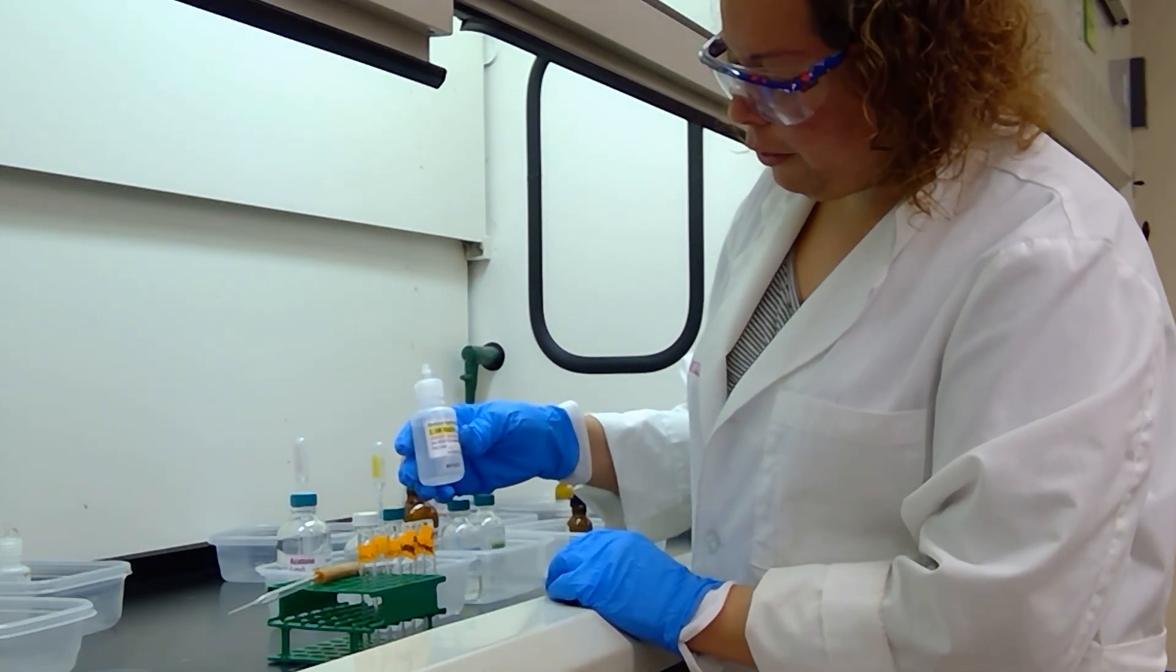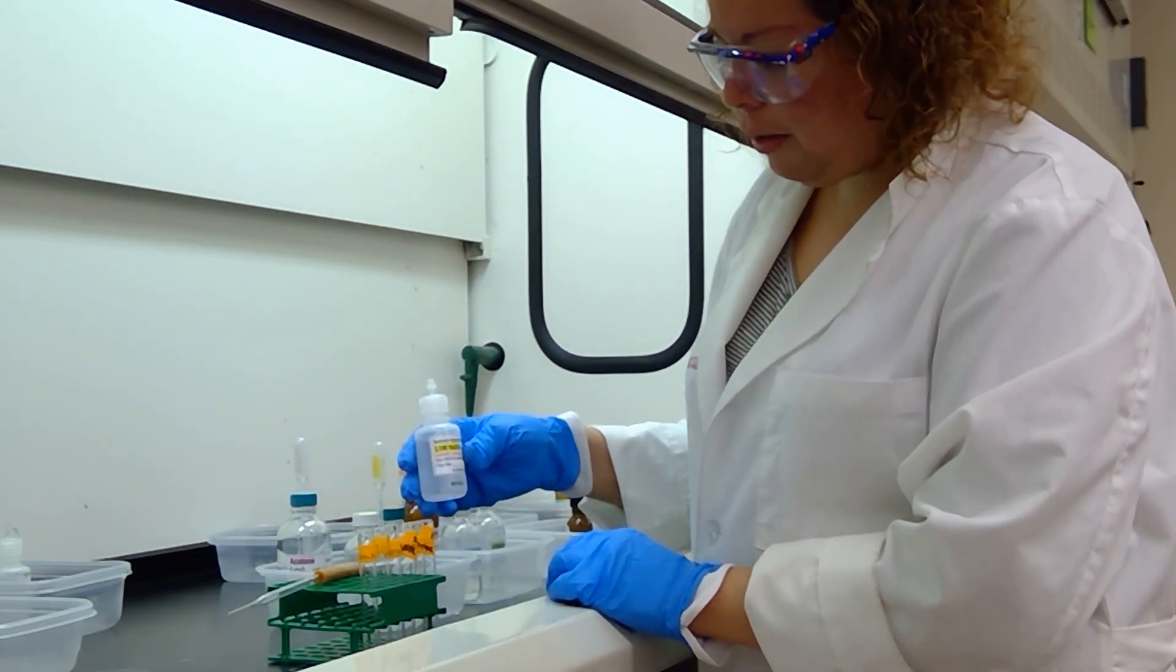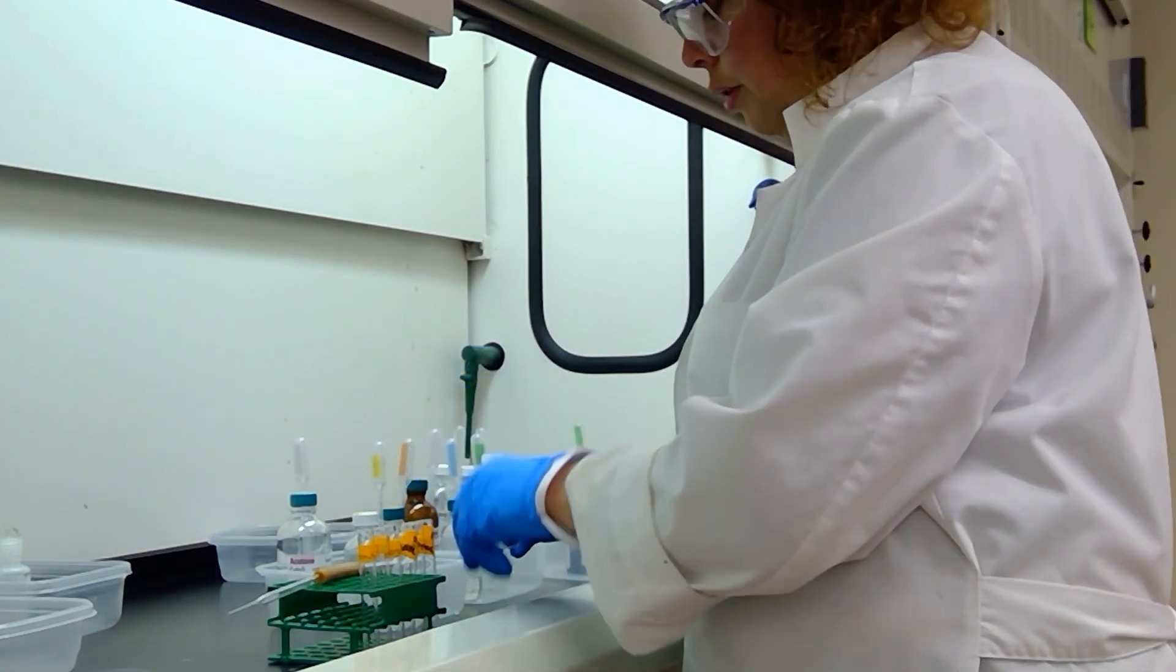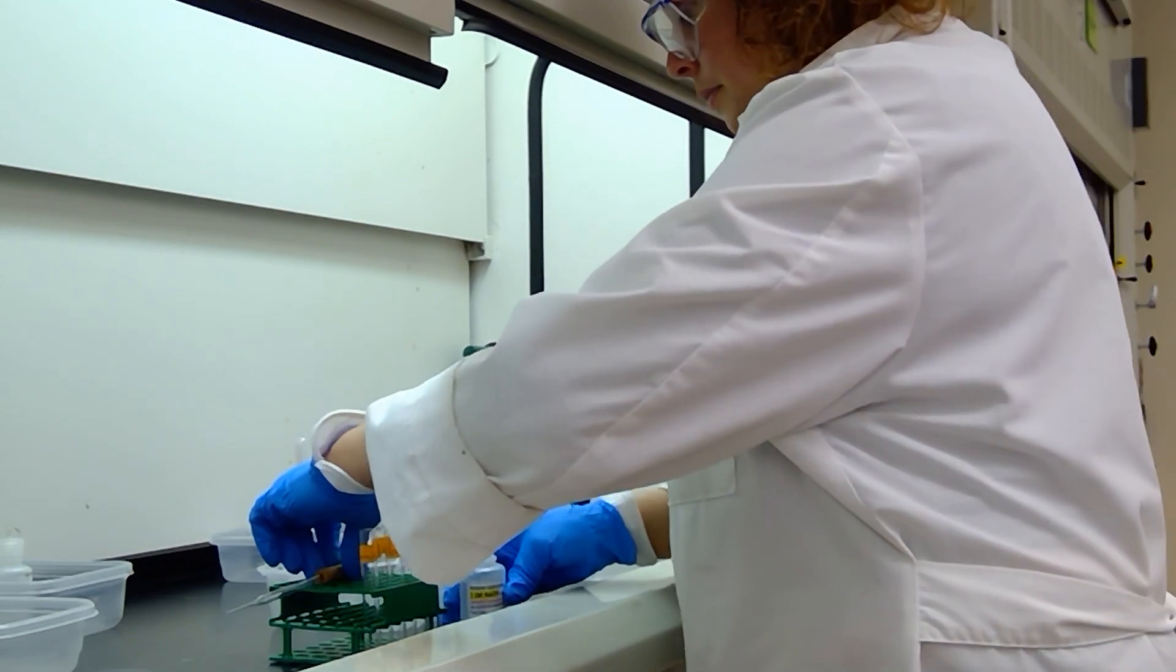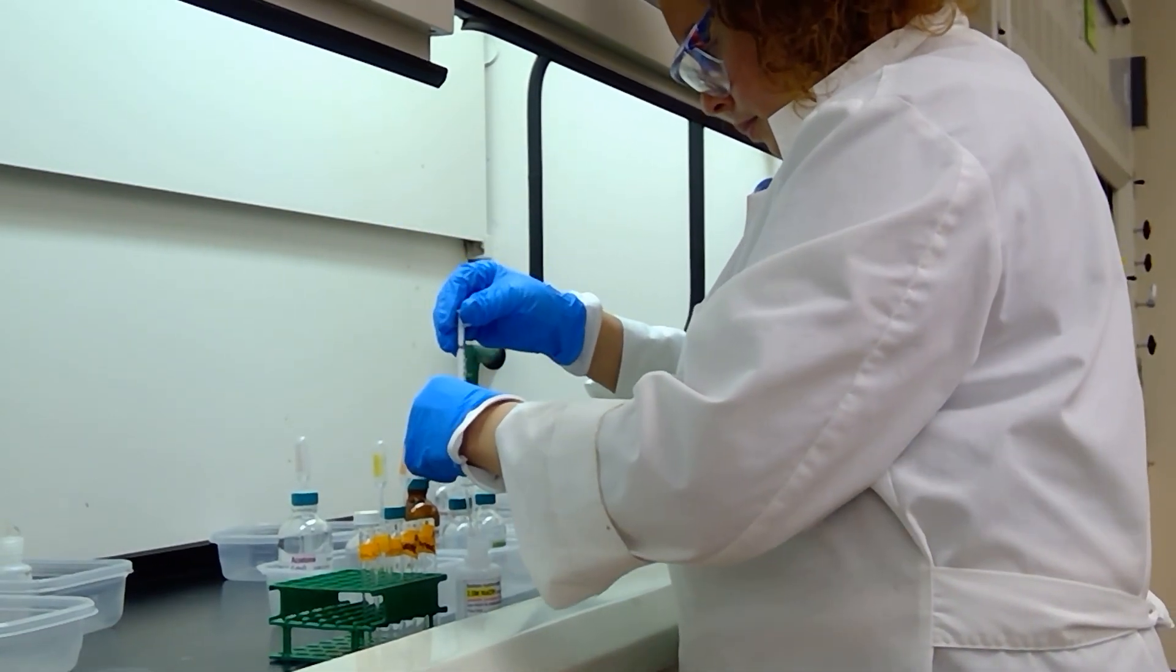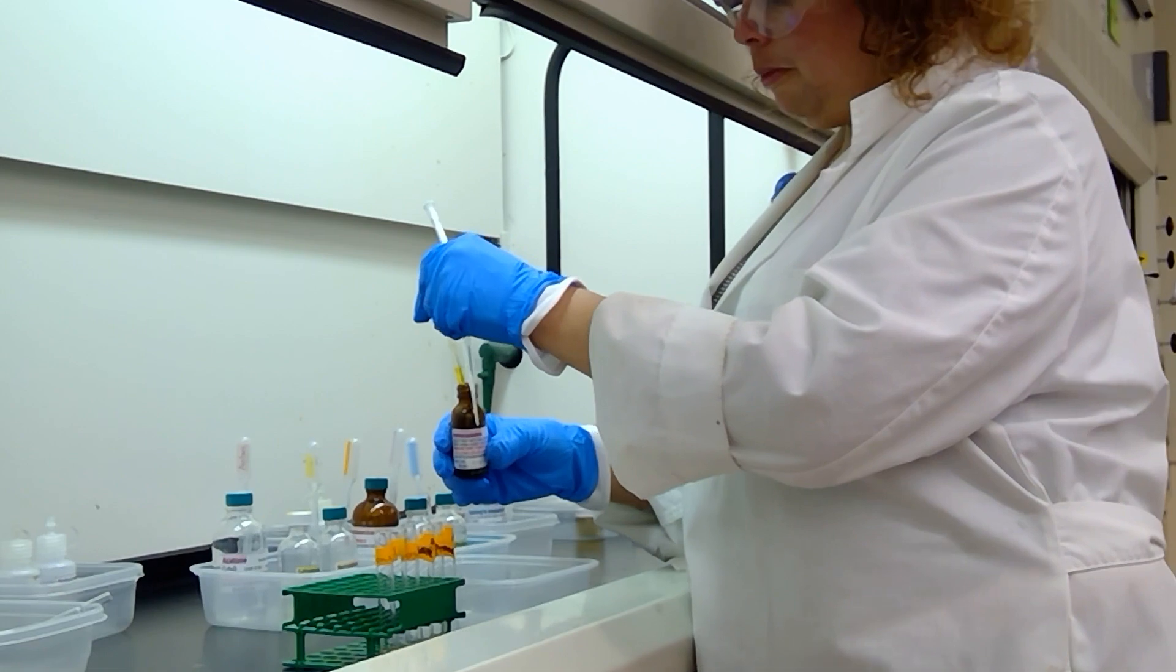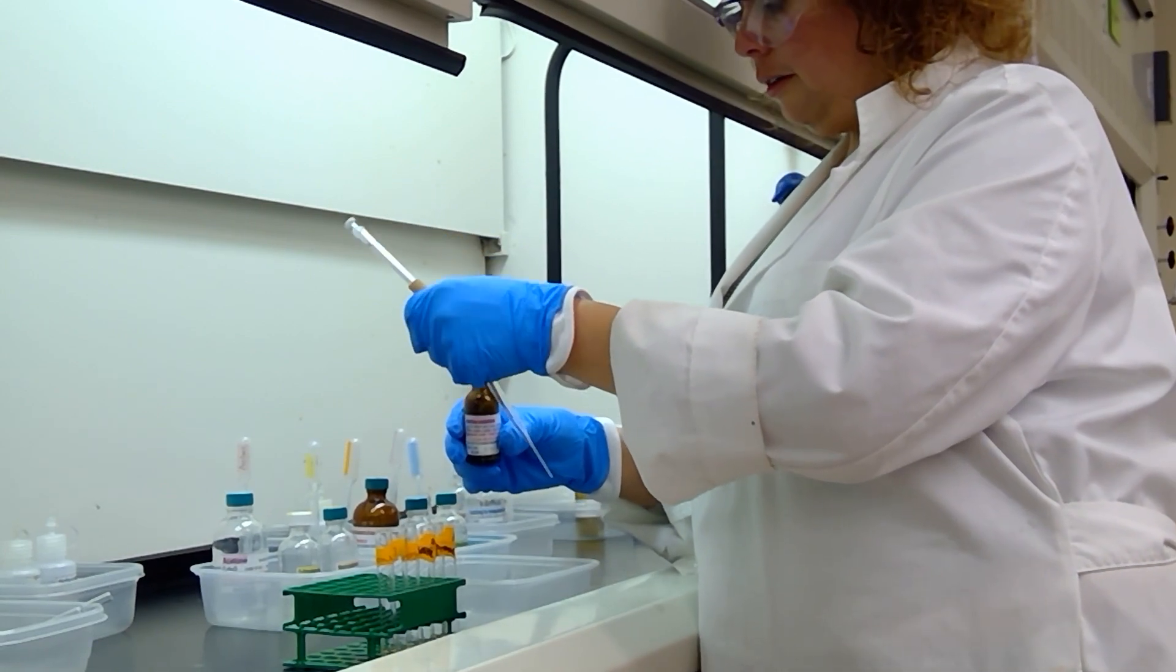Next up we are going to add 2.5 molar sodium hydroxide, this is the same as 10% sodium hydroxide, and for each of these samples we are going to add half a milliliter. I'm going to not dip this back in there because I don't want to leak out iodine solution.